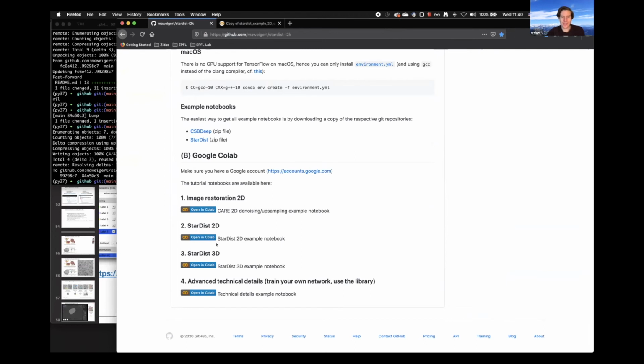Based on the initial poll, most of you are interested in 3D object segmentation, so I would propose we all go together through one workflow, StarDist 3D, and you follow along. If there are any questions in between, we're going to try to solve them live as a whole.